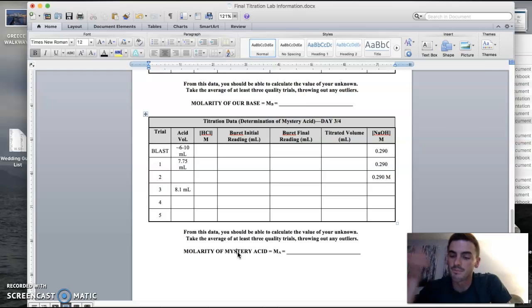But big picture, read your burettes carefully, okay? It goes opposite the normal numbering system. Don't forget your indicator. You want it as faint of a pink color change as absolutely possible. Be careful with the stir pills. Make sure we're using water to get every single little drop we can. Take your time. There's no rush.